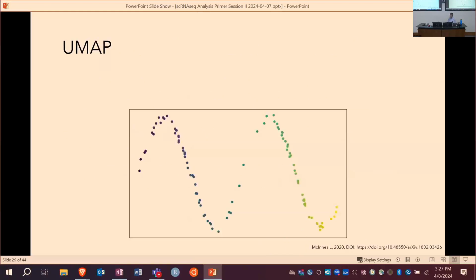So the UMAP authors give this example that we're going to try to track here. They start with a sinusoidal curve, which we can imagine is the true shape of what we're trying to uncover. But in reality, we observe these specific data points that are more or less scattered on the true surface or curve with some error term, right? We don't observe the exact surface as it is.